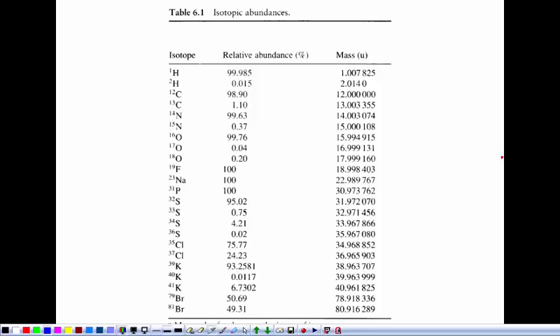And so if you have a halogen on your molecule, you're going to see two mass peaks. One of the mass peaks corresponds to the bromine with a mass of 79, and the other one to the bromine of 81. So you don't see a single mass peak, you see a double one. If you have chlorine, you have a double one, but they're not 50-50 now, they're 75-25.